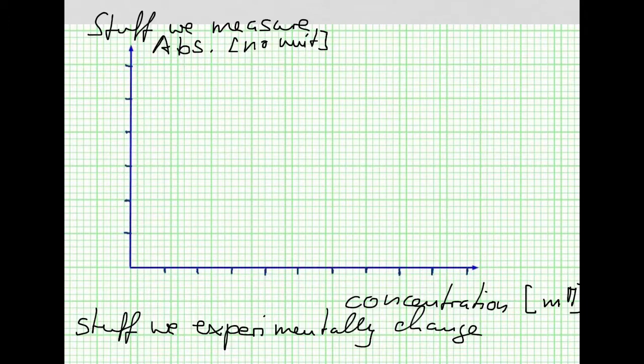And now what we can do is we can just simply put the data in. So, how do we go about doing something like that? I know lots of people have done graphs, but sometimes I see still rather interesting stuff from students. So the easiest way is to say, okay, fine, I have here my equidistant things.